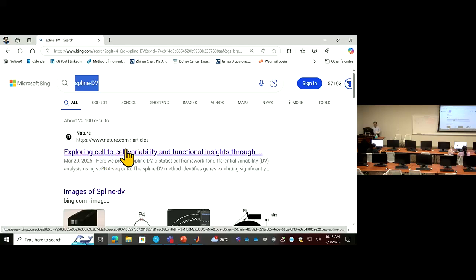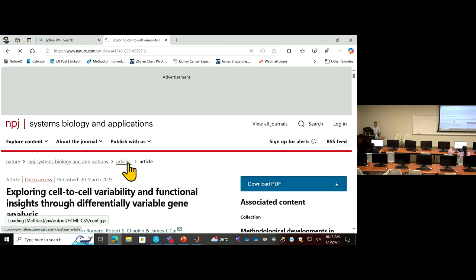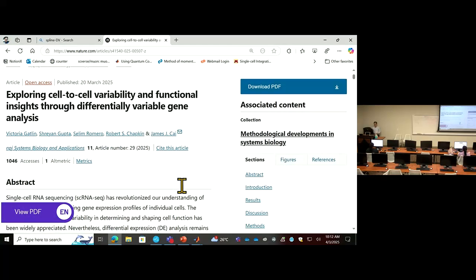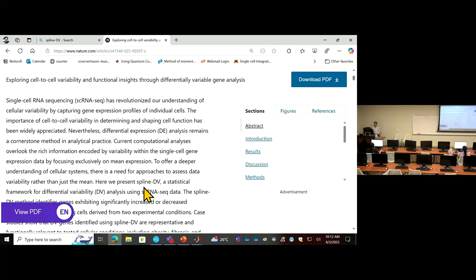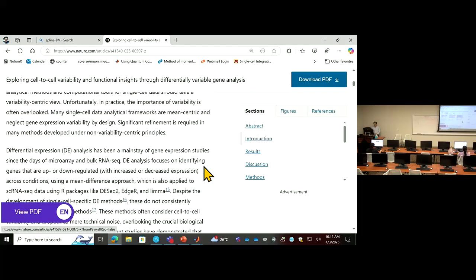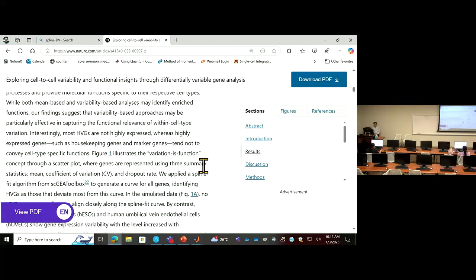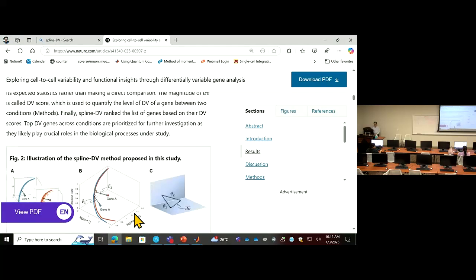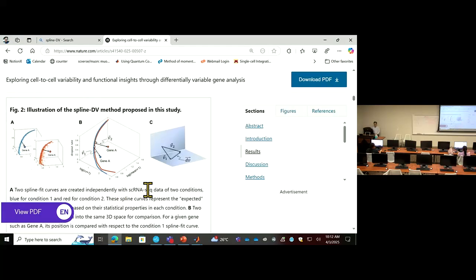This is a paper that discusses this application, this method, and the 3 case studies we used to show it. Okay, this really works. So what you need to do is browse this page down. You don't have time to read the details, but look at the illustration of the idea.